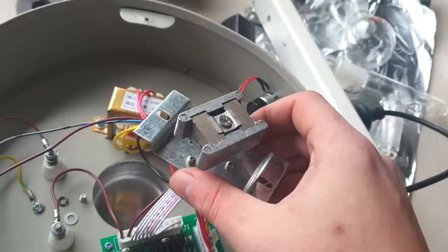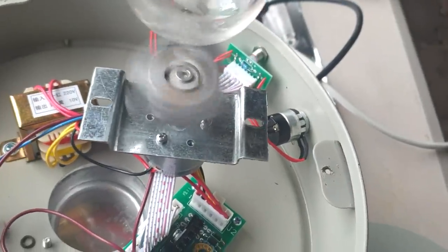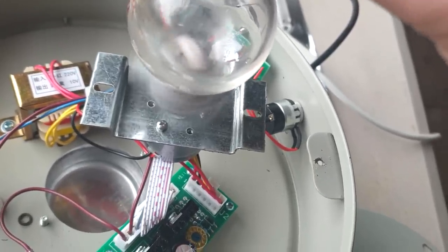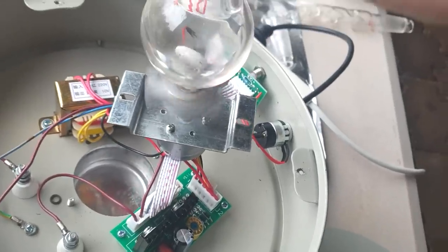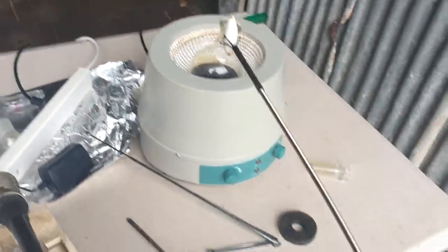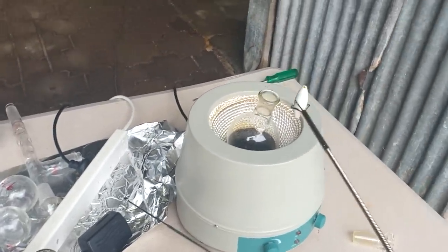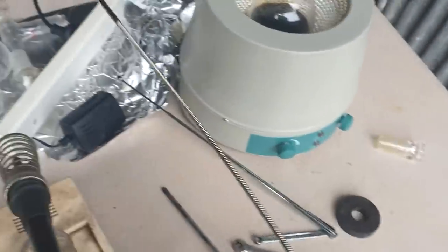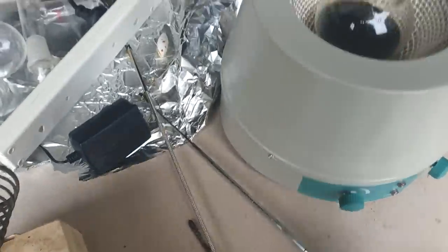All right, so this is a magnet here, and we can see it's spinning. You can see it doesn't really spin the stir bar unless the stir bar is really, really close to it, basically touching it. So why is the magnet so weak all of a sudden? All right, I've come to the conclusion that the heating mantle is fine, and the problem is all my oval stir bars are absolutely trash magnets. I couldn't even retrieve this stir bar with a magnet. I had to use this grippy retrieval tool. I had a magnet retrieval tool, and it can't even pick it up.